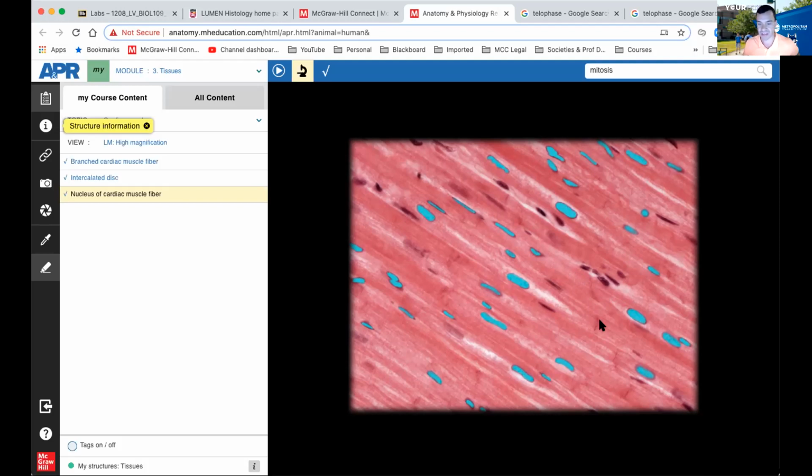But what do these things have? Once I see alternating light and dark bands, connective tissue, I'm in the middle. A lot of fibers. Yeah, there's a lot of fibers here, but I see some striations, and I see striations only in muscle. So here, I have striations, muscle. Okay, now is this skeletal or is it cardiac? Because those are the only two. And I see those dark perpendicular lines there, so boom, cardiac muscle.